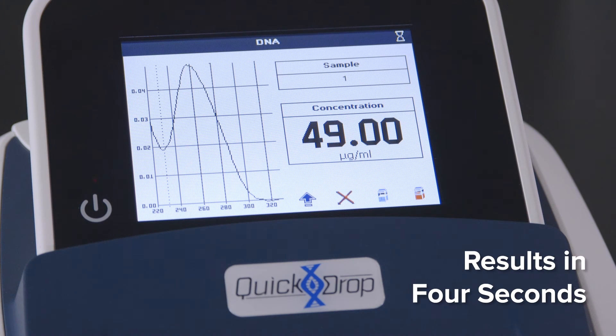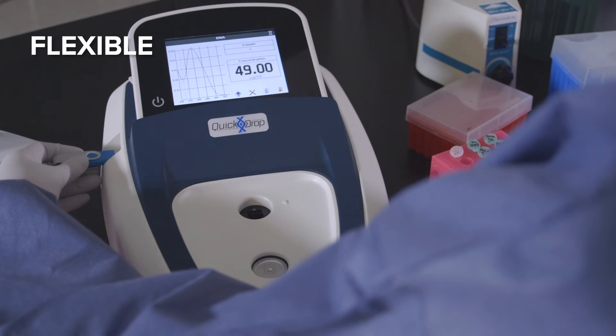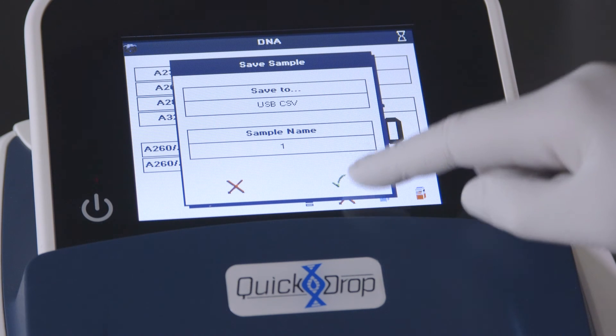It is also compatible with standard 10 millimeter cuvettes for larger samples. This standalone tool requires no PC or additional software to operate. Export results to a USB drive to analyze your data in the program of your choice.